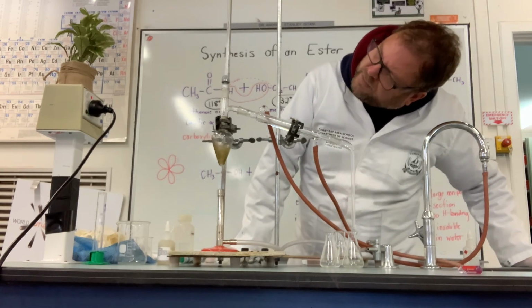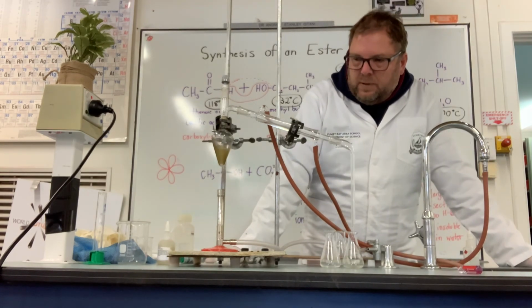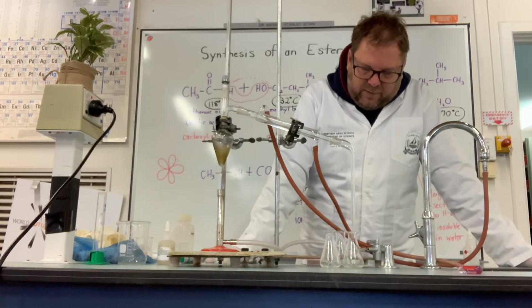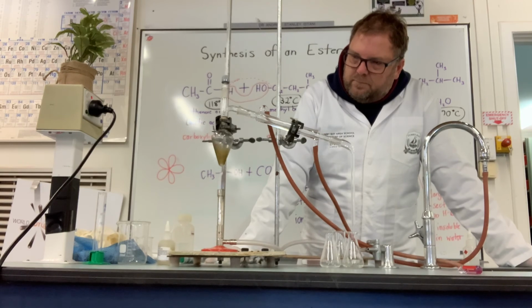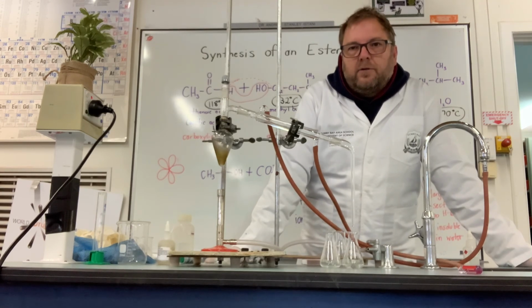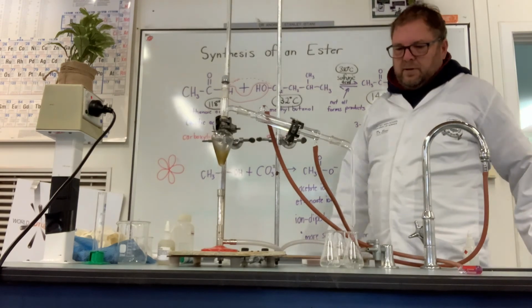Yep, that temperature's stabilised out there now at pretty much 140, that thermometer's saying. So we would hope that that vapour that's coming across now is the ester. And I'm getting that really strong smell now of the banana, so hopefully that is that chemical, that 3-methylbutyl ethanoate that we're just trying to make.